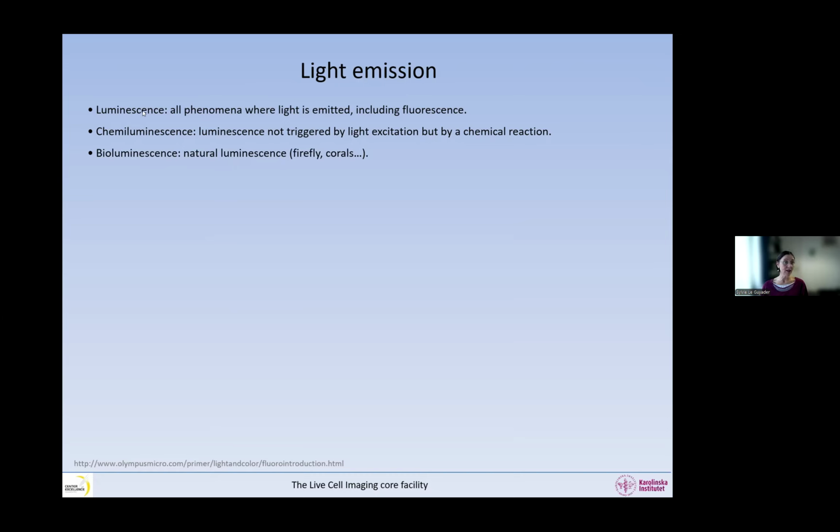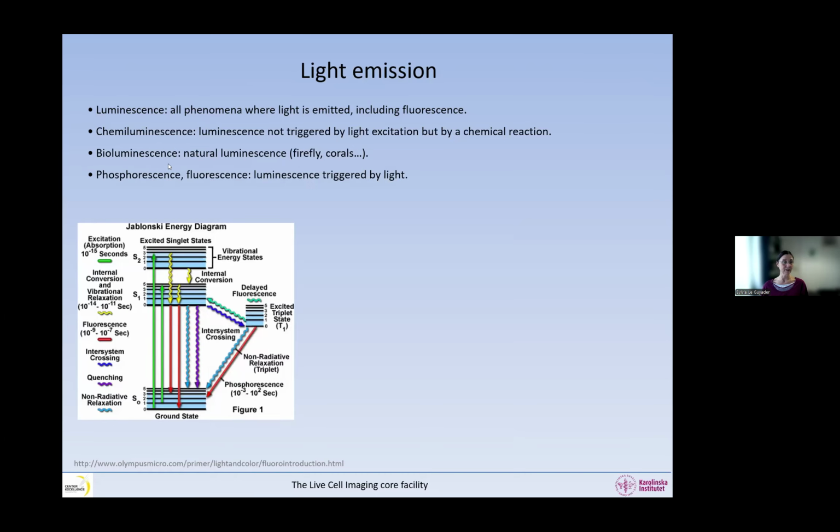So all these terms really refer to the same thing, but depending on where it is, and also if it's chemical or it's triggered by light, then we have slightly different names. And then we have phosphorescence and fluorescence. And in that case, the luminescence is triggered by light.